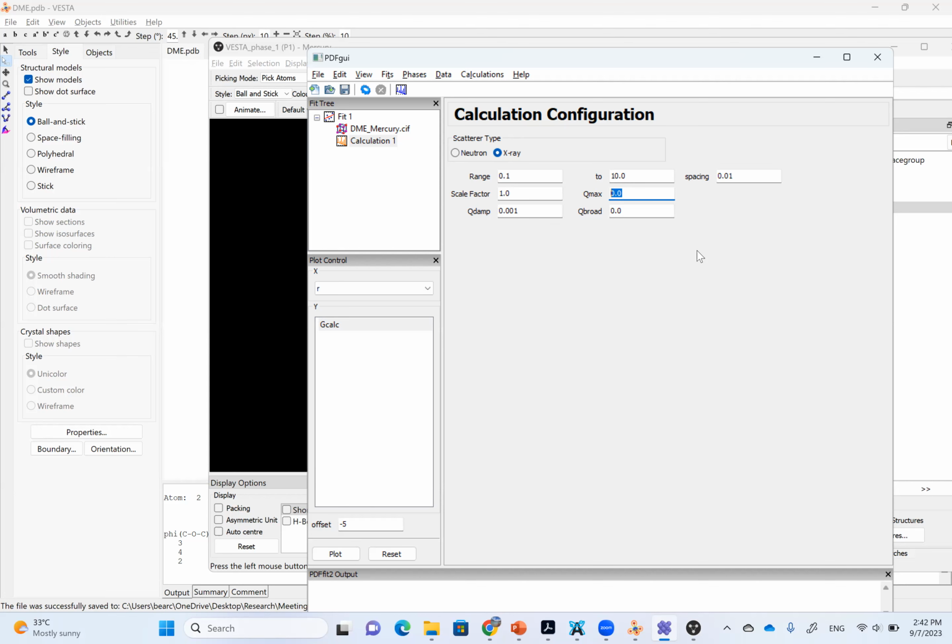It will smooth out the higher values. Smooth out? No, it's mostly acting on the lower region.